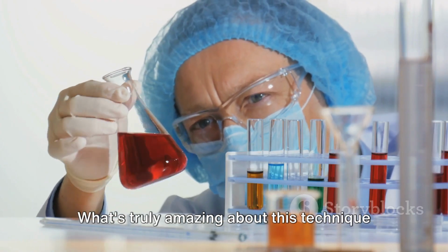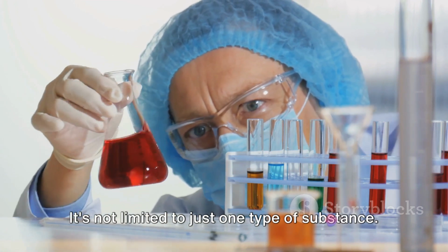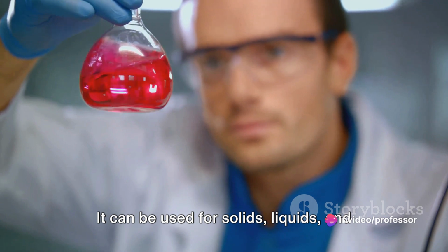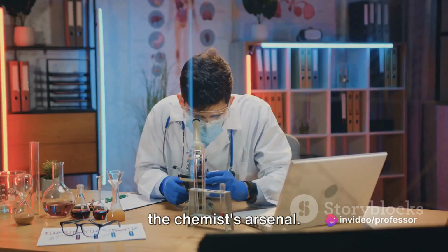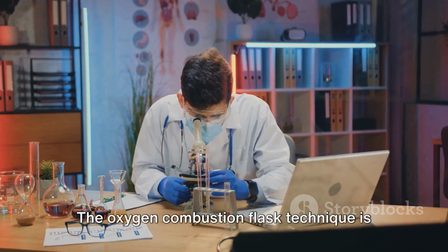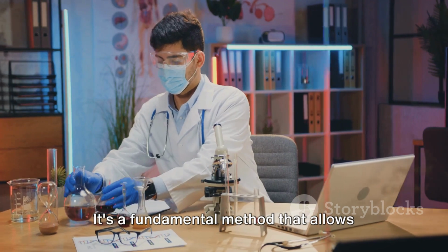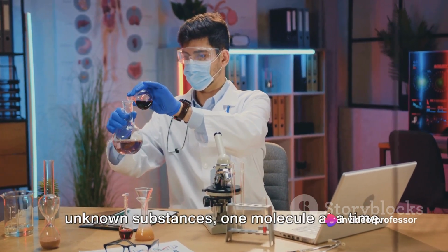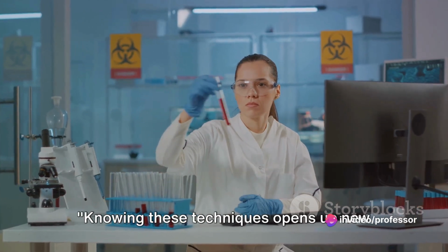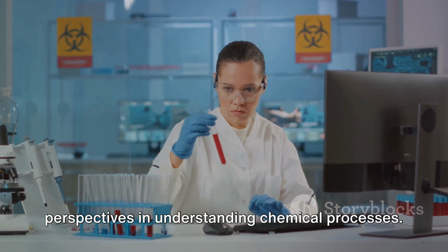What's truly amazing about this technique is its versatility. It's not limited to just one type of substance. It can be used for solids, liquids, and even gases, making it a powerful tool in the chemist's arsenal. So, there you have it. The oxygen combustion flask technique is more than just a mouthful. It's a fundamental method that allows chemists to unravel the mysteries of unknown substances one molecule at a time. Knowing these techniques opens up new perspectives in understanding chemical processes.